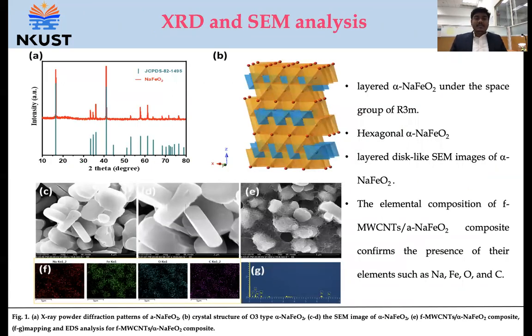This is our catalyst. We prepared a layered material of sodium ferrite in combination with functionalized multi-walled carbon nanotubes. Here we can see that the XRD pattern shows a hexagonal crystal structure, and the image shows a layered disk-like structure.